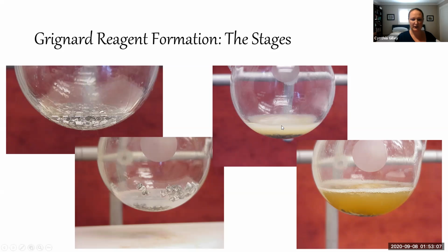So that's why the volume here has gone up, and we can see bubbles. The bubbles are from the diethyl ether that is boiling because the reaction is exothermic. As I mentioned, there's some brown color that forms, and it tends to be even browner if you add the bromobenzene solution even faster into the solution.